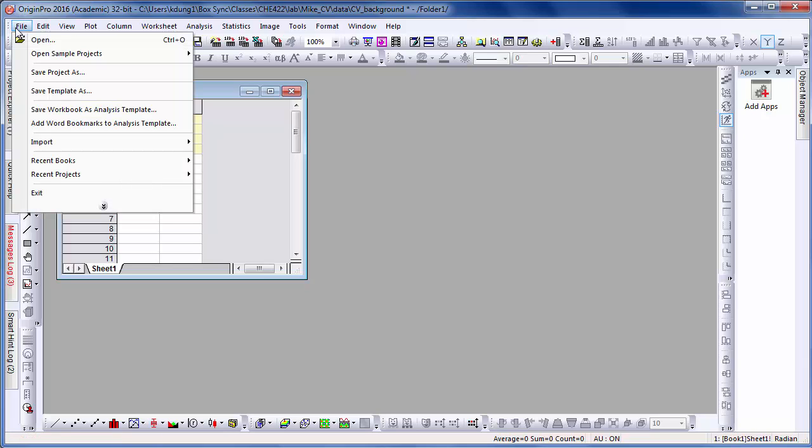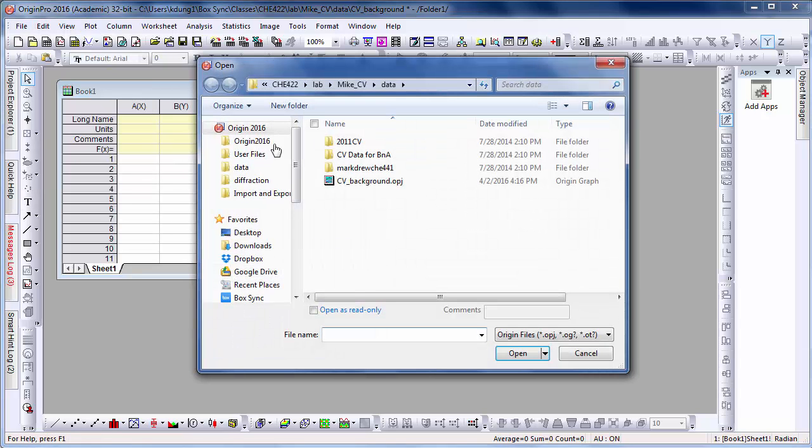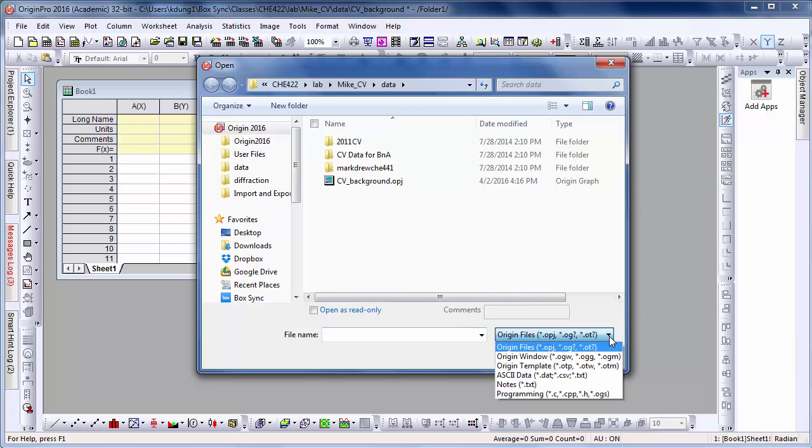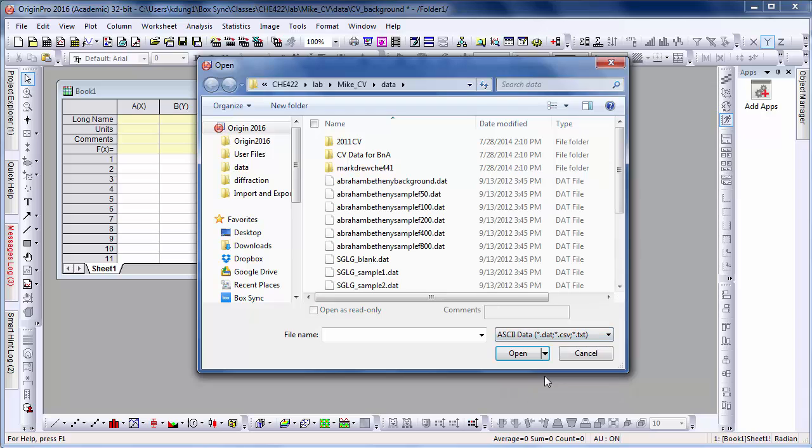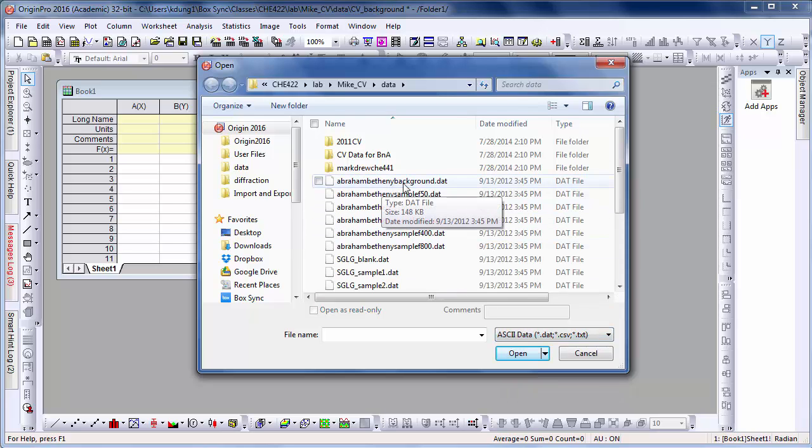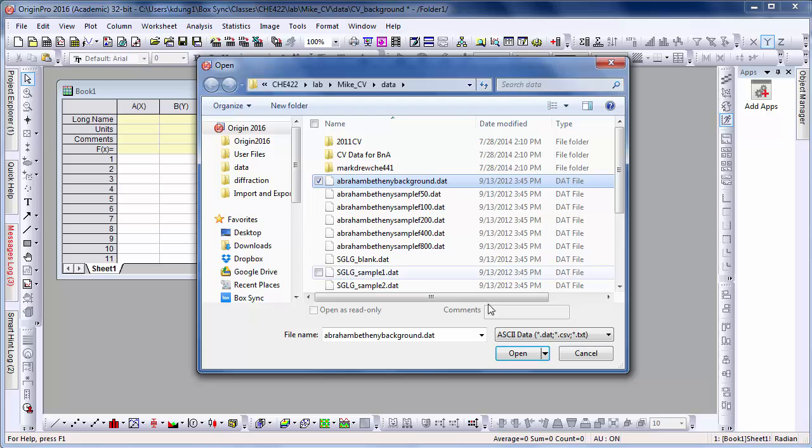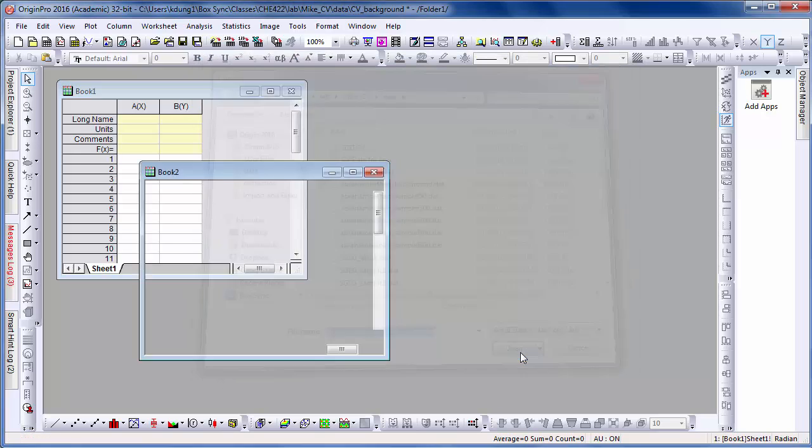Hopefully your data was saved from the electrochemistry workstation as a .dat file. If not, you can rename it and it will still work. Here I've named this background file.dat so I can open it in Origin.